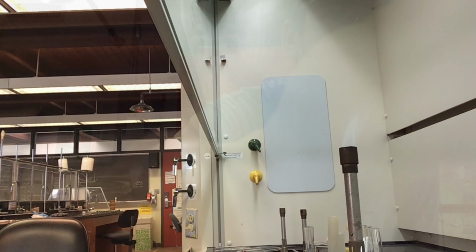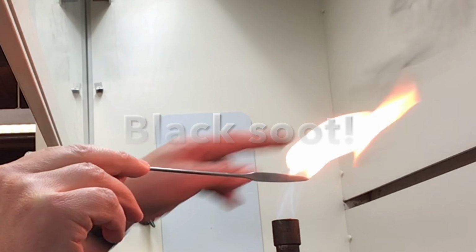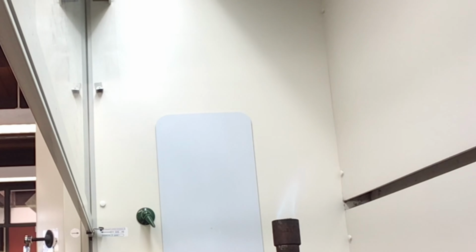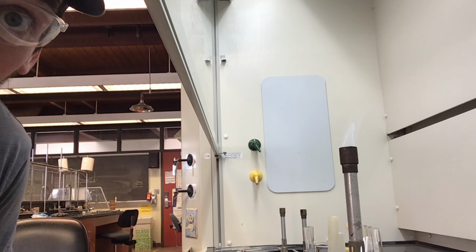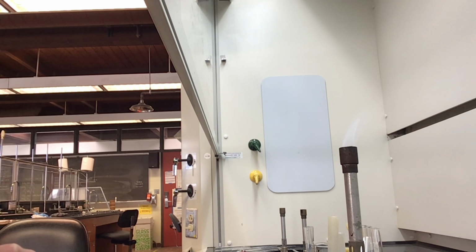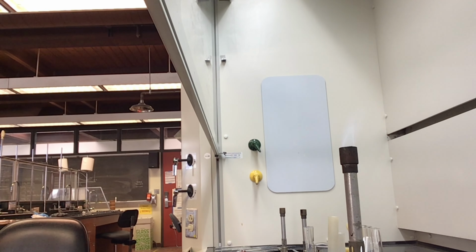Check it out. Remember, what we're looking for is a black sooty flame for something that's aromatic, and the absence of that black soot for something that's not aromatic. It's pretty obvious. You'll see here as I put the aromatic compound in there, we got black soot. It's just smoky, right? Definitely something gross that you don't want in your campfire. Whereas this one is gorgeous. It looks like a nice little fire, a hot flame for us to enjoy fireside. Maybe cook some s'mores. All right, so that's it. Straightforward.